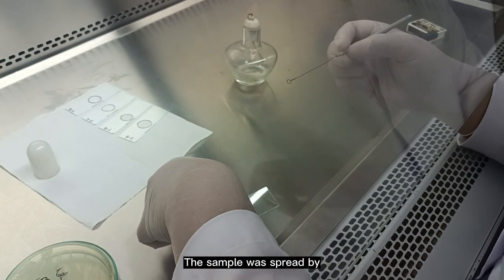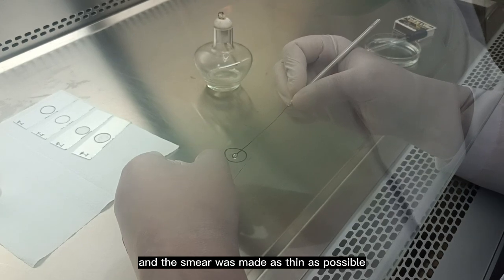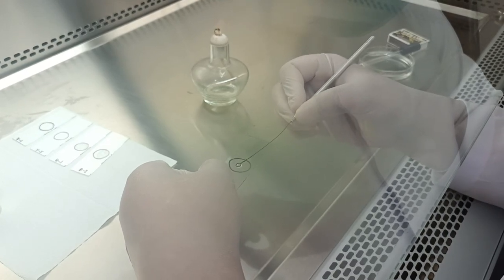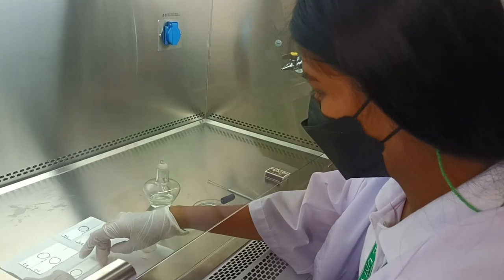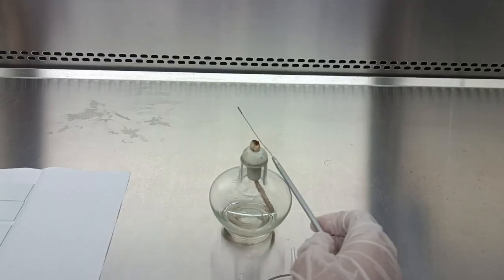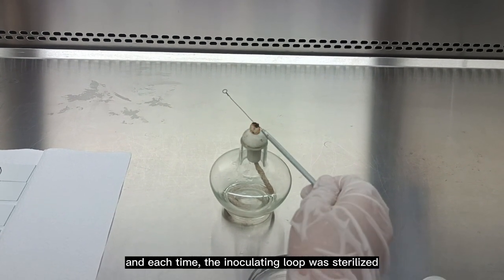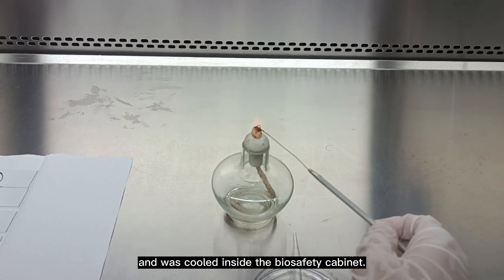The sample was spread by smearing in a circular motion on the glass slide, and the smear was made as thin as possible. The smear was air dried, and the labels were checked. The same procedure was done for the remaining samples, and each time, the inoculating loop was sterilized and cooled inside the biosafety cabinet.